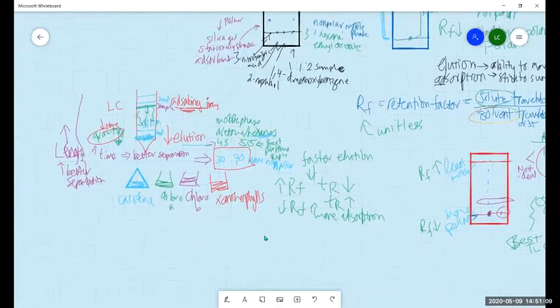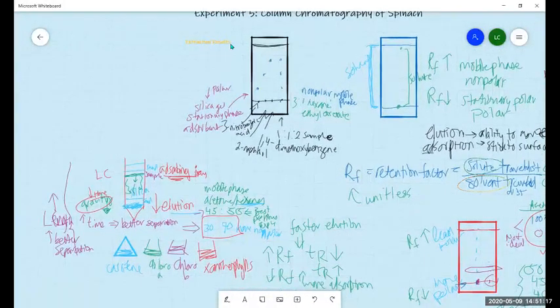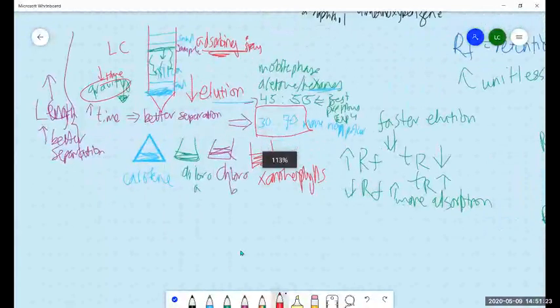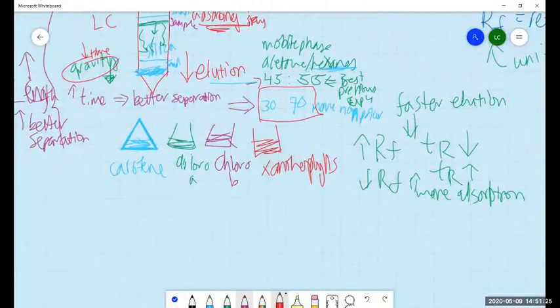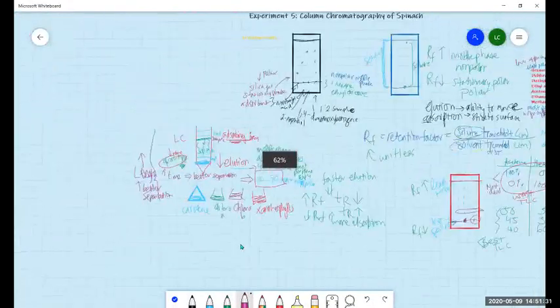And then once you had these 4 samples, we're doing the exact same thing as experiment 3. It's assessing how good of a job we did for separation in experiment 3 with extraction results. The TLC part of the liquid chromatography, which was the second component, wasn't the principle of separation. The principle of separation, I think this is a big point to take note of, is column chromatography.